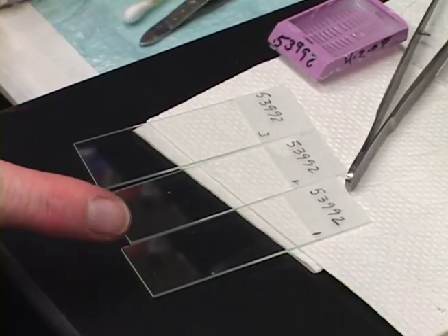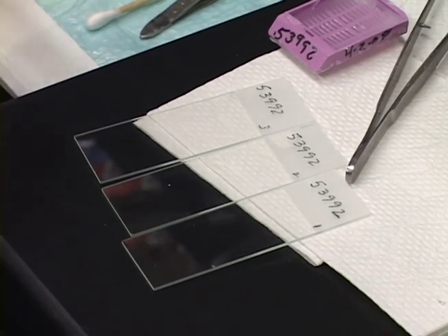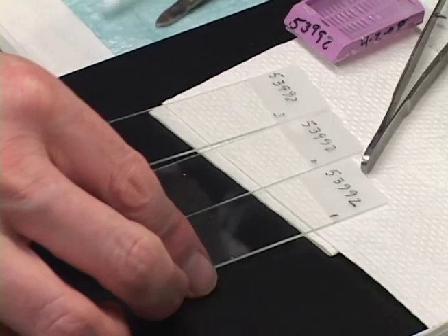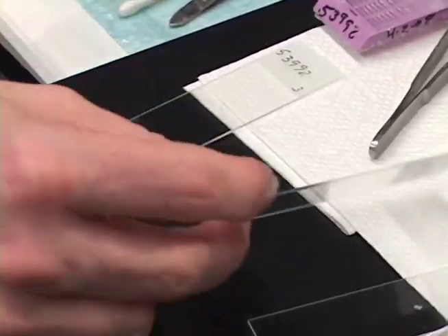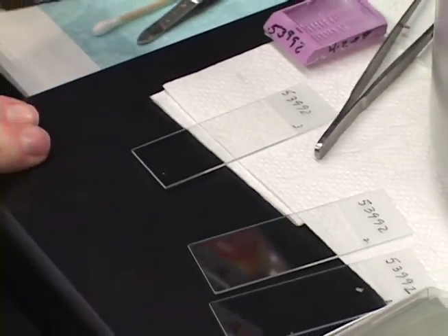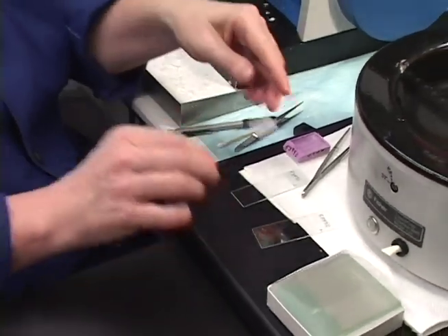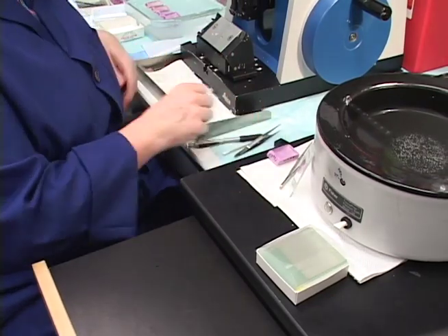Another important thing about using a pencil is that pencil flakes and shavings can get onto the slide, so I tend to give it a little tap to get those off. That's another reason I like the KP Marker Plus — no pencil shavings and no smearing.